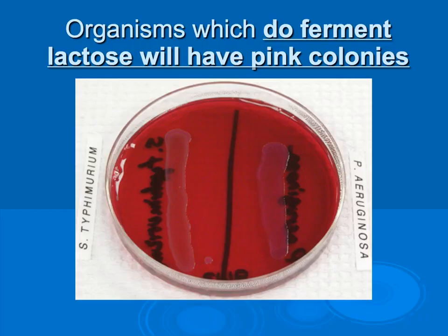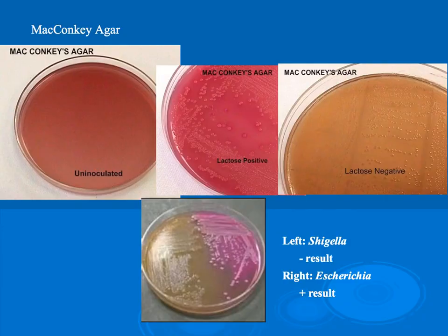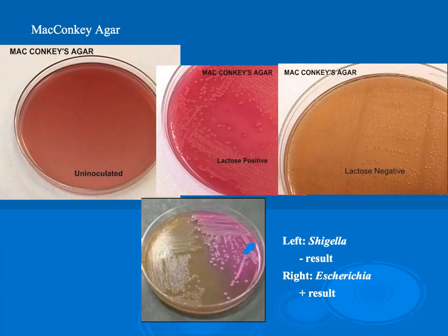Here we have MacConkey agar. MacConkey agar is both selective and differential, and it's used to differentiate between Gram negative and Gram positive bacteria. It is selective in that only Gram negative bacteria will grow. We have a non-inoculated dish and three dishes with growth, which indicates all three are Gram negative bacteria. In addition to testing for Gram negative, the test will also identify lactose fermentation or non-lactose fermenting. If we have pink colonies, we have lactose fermentation; if we have clear colonies, we have no lactose fermentation. Here we can see non-fermenting and fermenting of lactose.